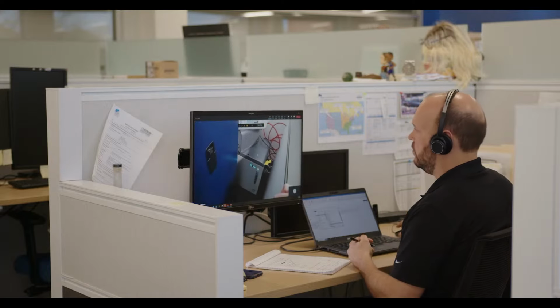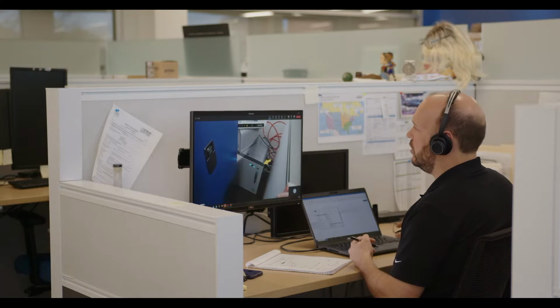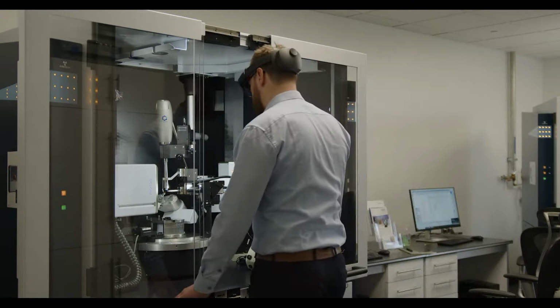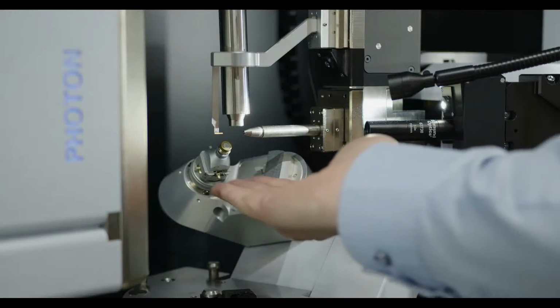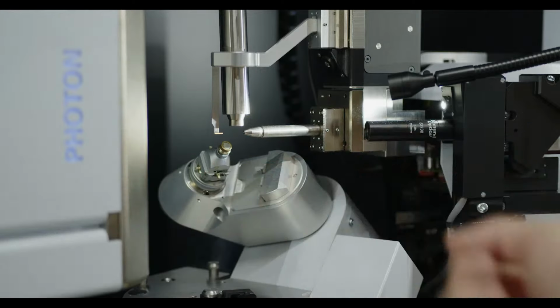Perfect. And that'll take probably about 10 or 15 seconds. And then I'll actually have you check on the low temp device to see if you feel dry air coming out. You should feel a steady stream. Okay, I will go back to the device. Let's see, let me quickly remove the sample. Oh yeah, I can feel some dry air coming out, and it's getting colder.